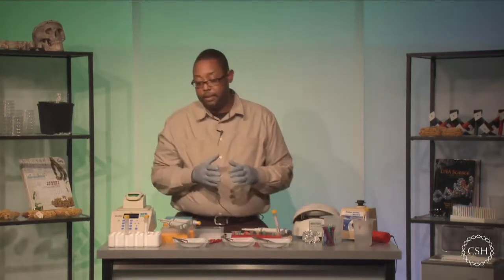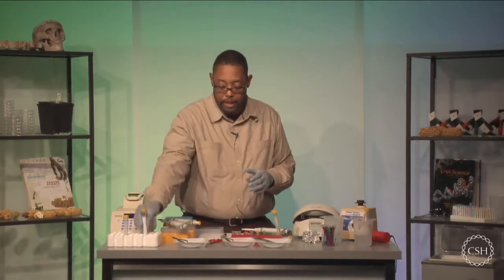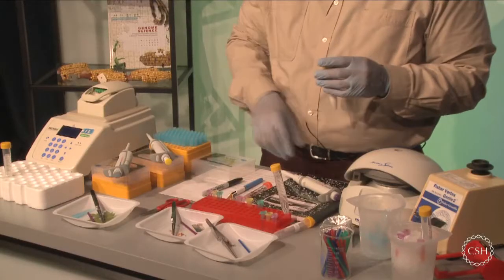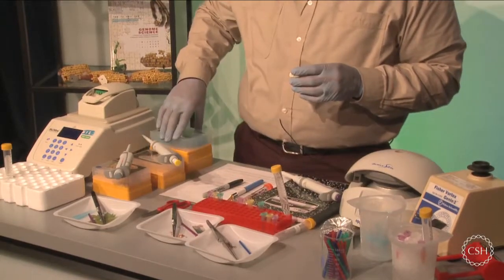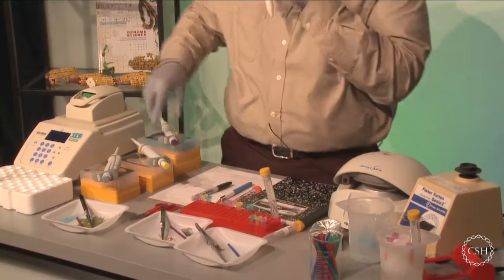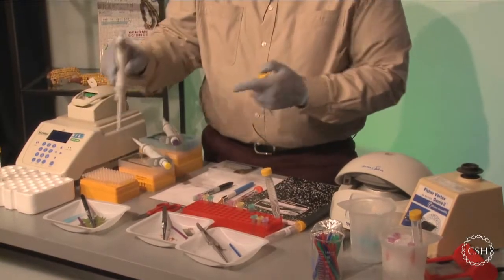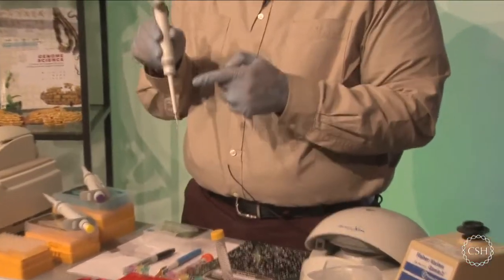So now I need to go and collect that DNA, and I'm going to bind all that DNA up by adding my silica resin. I'm going to take the silica resin at this moment, and I'm only going to use 3 microliters of it. So now I'm going to need to shift over to my P10, which is already set to 3 microliters, and I'm going to add 3 microliters of silica resin to each sample.